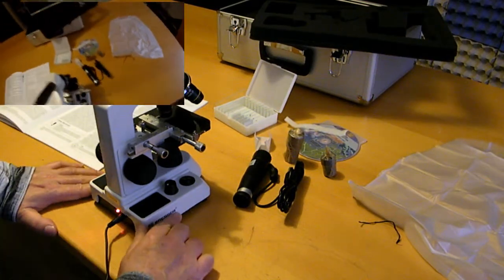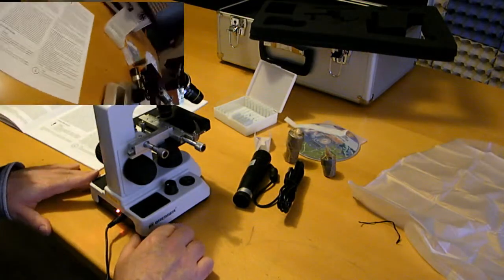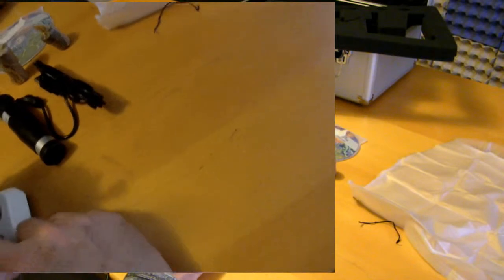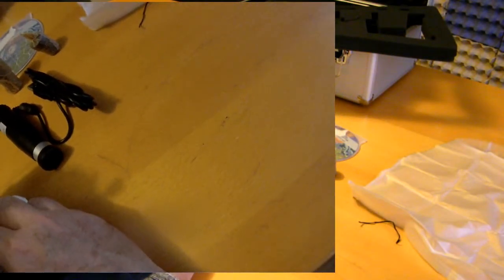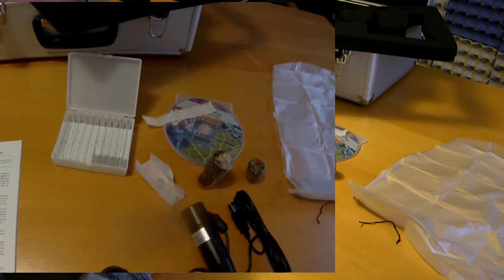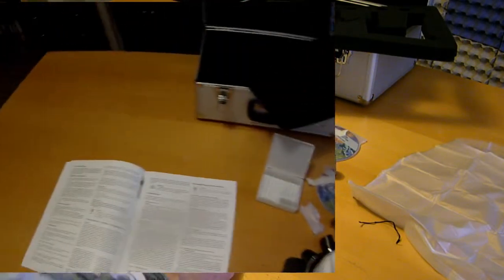So is there a light down? Switch it on. Yeah, there is a light. And you can dim it. Don't know if you see it. You can dim it. Let me have a look through it. Yeah, you can dim it. Alright.